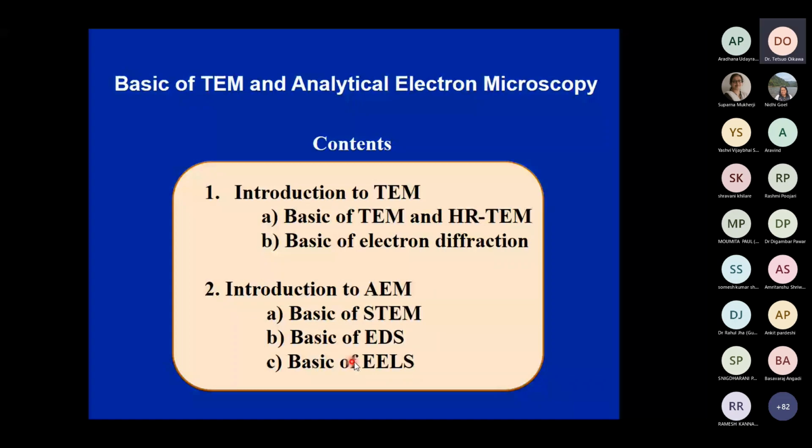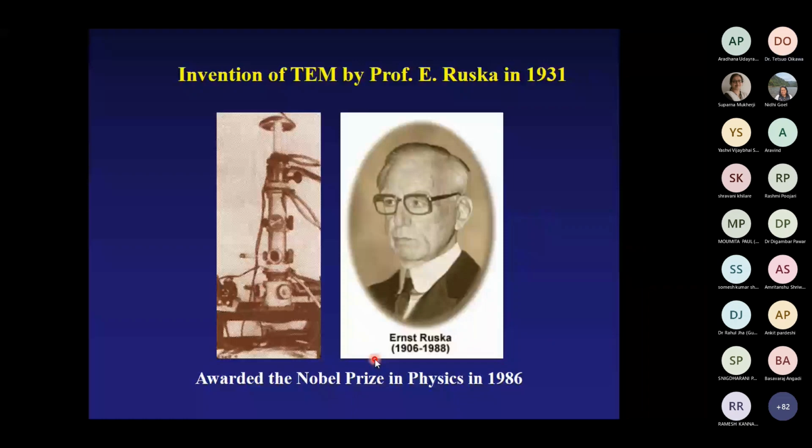Now I'd like to start the introduction of the transmission electron microscope. The transmission electron microscope was invented in 1931. In that generation, a young engineer, Dr. Ruska, invented this microscope.